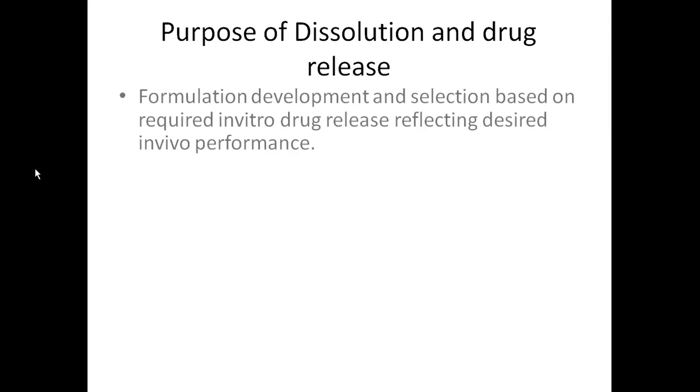First, let us now understand the purpose of dissolution and drug release. You should remember, dissolution is a study of the rate and extent of the drug being released from the dosage form. The first thing we do for a dissolution test is formulation development and selection based on the in vitro drug release, which reflects the desired in vivo performance.